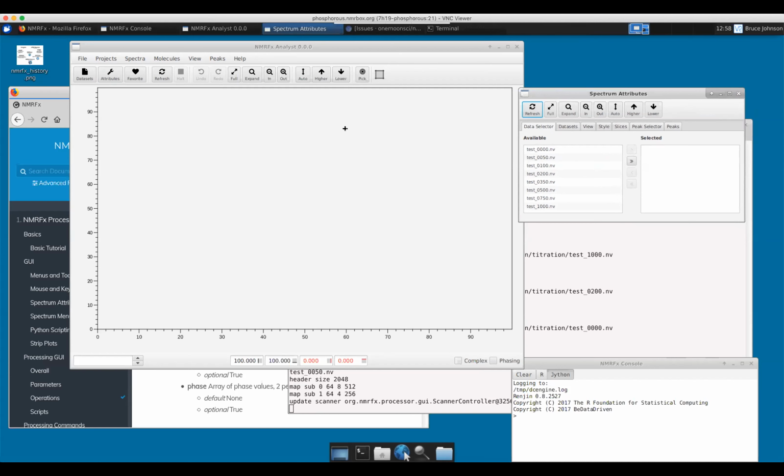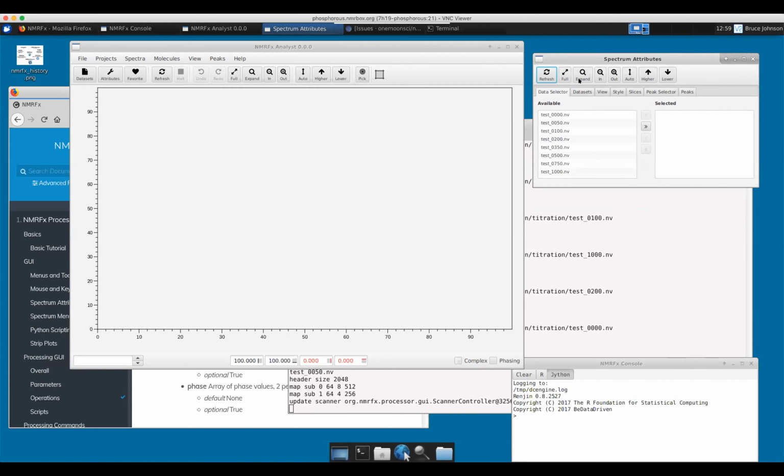Okay, so let's assume that you did that. Then you could just go to that output folder and then open them all up. I have to think about exactly how they would be named. I think they would all get a single name, so make sure that you have the right names. Another thing: you can create a text file that is a list of all the files that you want to process and read that file in, and it will find them all. That way you can assign them concentrations and things like that and process them. So that's another way. Something I really need to make some video tutorials on.